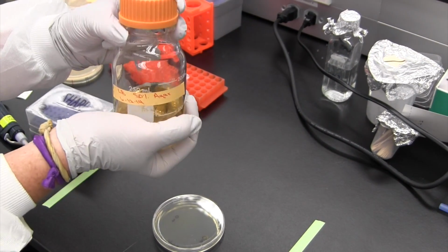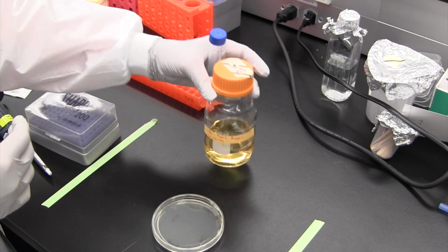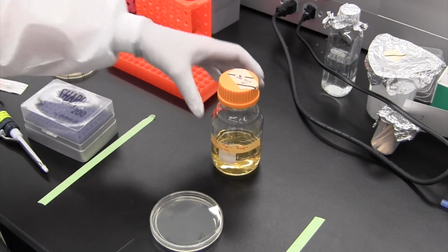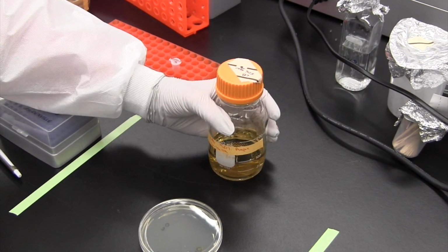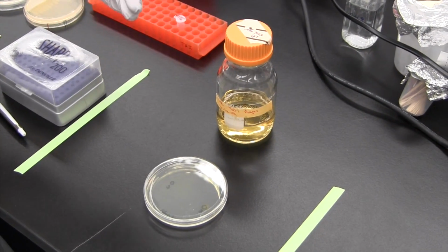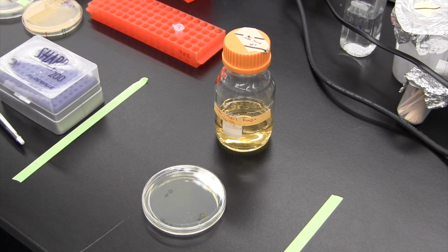So you need to make sure this isn't so hot that it's going to kill your bacteria when you mix the two together. Many schools might have your soft agar in a water bath in your lab, and that's a really easy way to have them already aliquoted out into 7 mil tubes. If that's the case, you would take that, add the bacteria after the fact, and then vortex it.